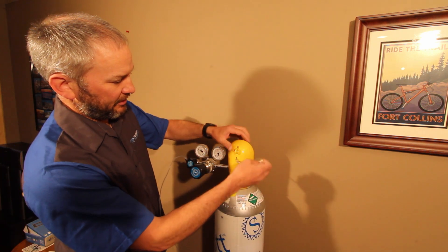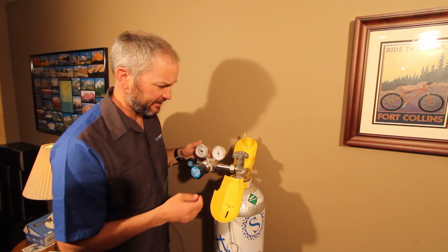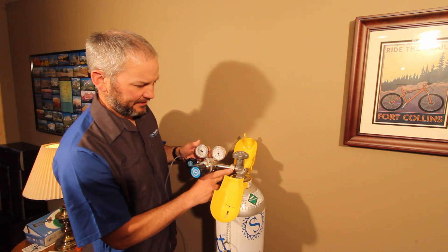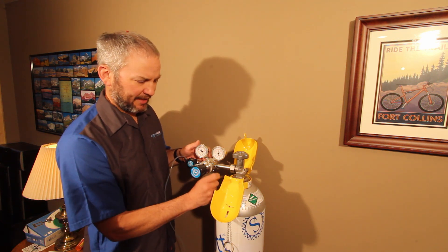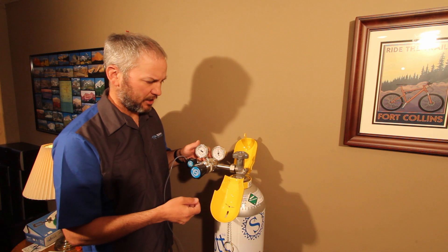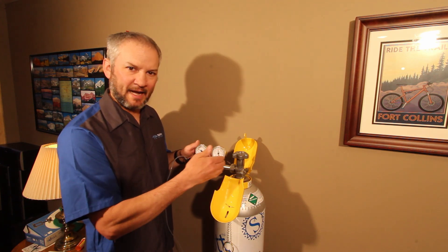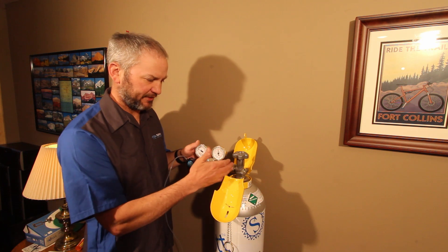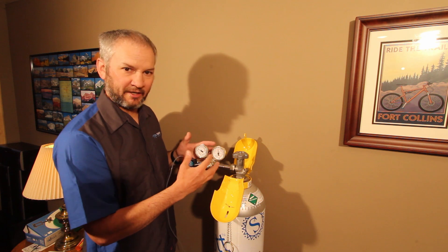Before we even mount our cylinder regulator, what I'll often do with these types of cylinders is inside this neck area here, I'll use a cotton q-tip swab and clean that neck out with either some deionized water or some isopropyl alcohol — something that I can guarantee that if anything's gotten into that neck, the valve section, during transport, we've got it cleaned out.